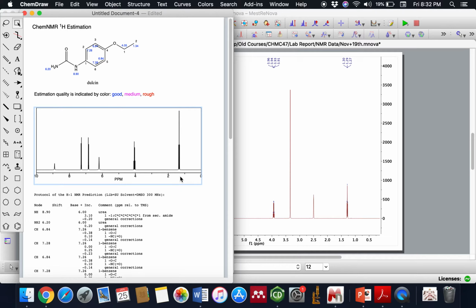So usually a rule of thumb is that you pick the CH3 peak because it's the least de-shielded one, right? Usually comes out between 1 and 2 ppm, and you can almost confidently say that it's a CH3 peak, so we can use that as our starting point. Remember, you should always have a starting point, and then everything that you integrate from that point onward is with reference to your starting point. So you have to be sure of your first peak.